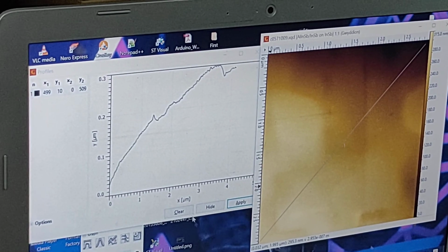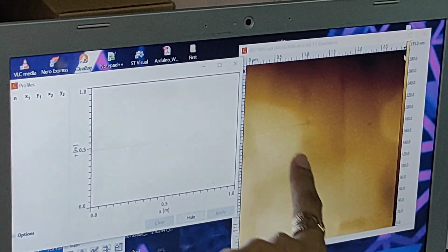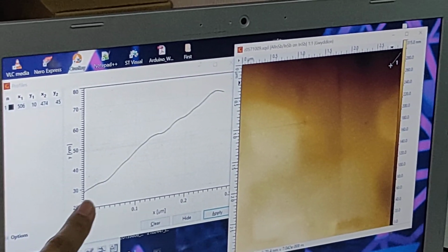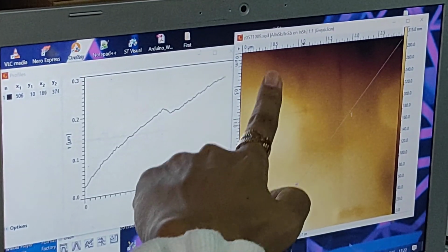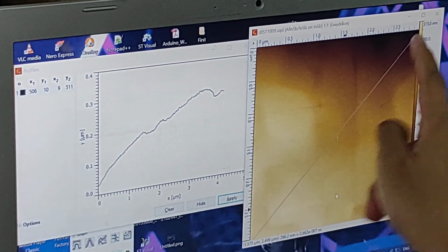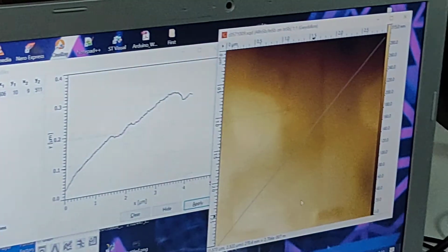Okay, by the way, I will start again. I start from here. Okay, the cup goes like this, right? This is the lowest, this one. Okay, that is for example.